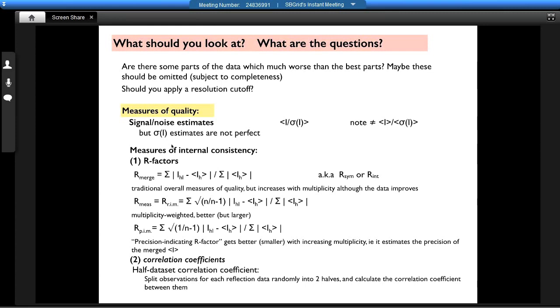Incidentally, one reason why these R factors that we calculate here are completely different from the R crist is that the thing under the bottom, the sum of intensities, when you do it in shells, can go down to 0, and can actually go negative. So this R factor, as you get weaker and weaker data, will go up to infinity, in principle.